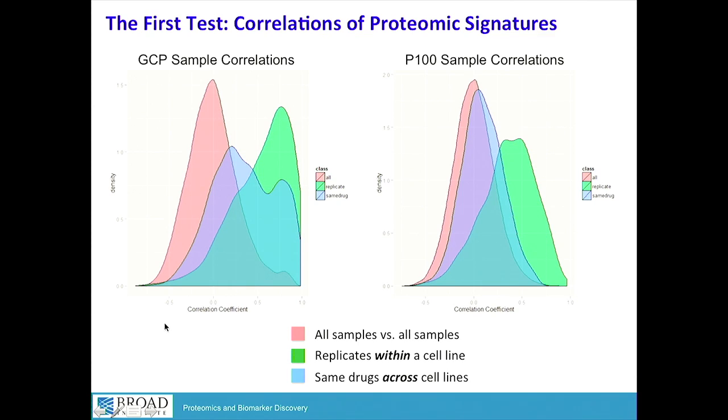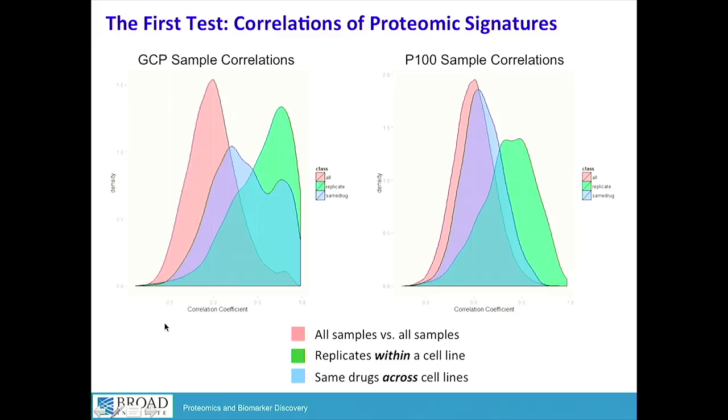So now I'm going to show you some data from our early efforts here. All these data will be looking at a series of drugs that are known to have epigenetic activity, as well as some control drugs. But the first question that we needed to ask is, with these new drugs that the assay was not necessarily trained on, neither assay was trained using these drugs for the most part, would signatures be able to be generated that were reproducible across them? So luckily, the answer is yes.